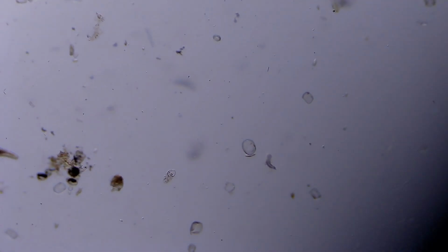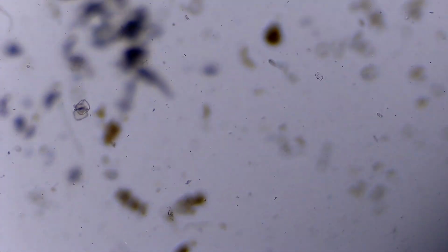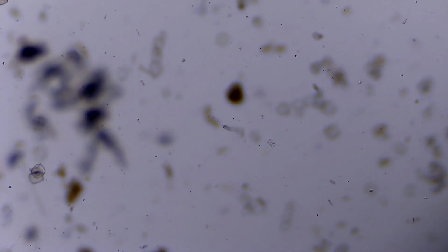I'm not sure, but this bug is definitely some kind, I'm saying bug, but this other guy, the one that moves quickly, that's not worm-like, is probably some kind of a copepod. Guys, if you know what it is, let me know in the comments down below, so that we all are just a little bit more well-informed.